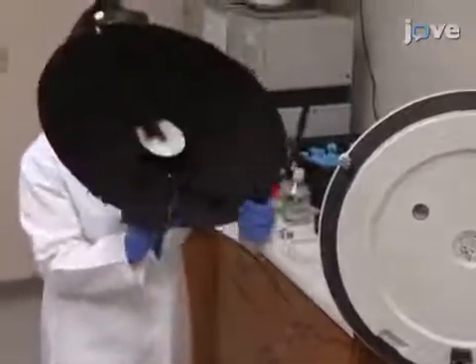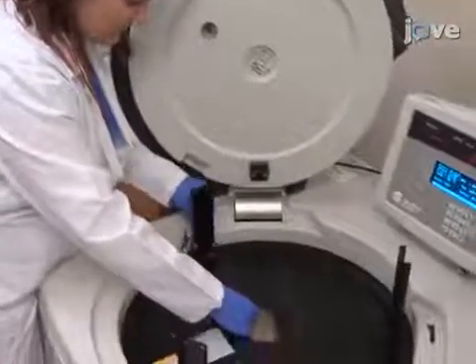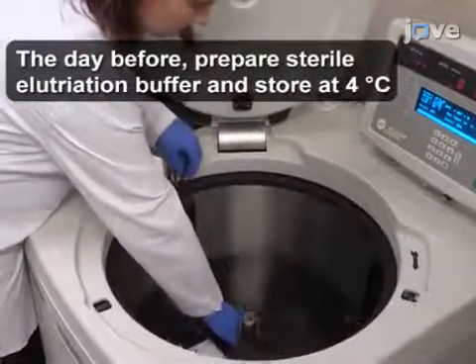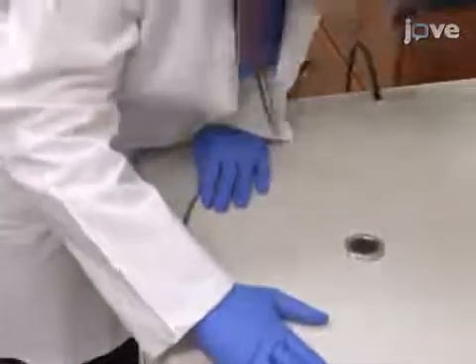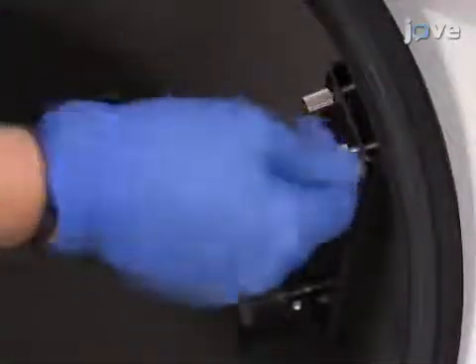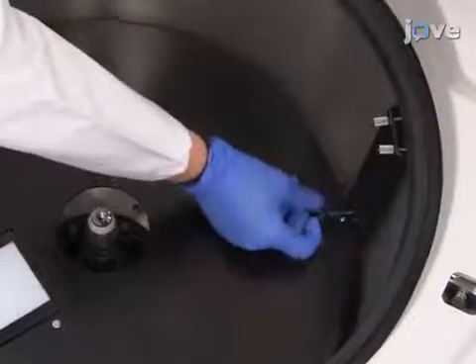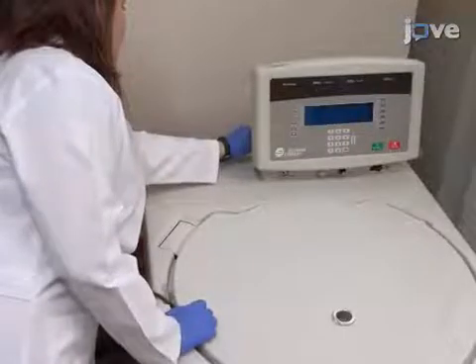To start the experiment, install the strobe assembly into the centrifuge such that the power cord is fed out of the chamber through the port on the left. Adjust the strobe flashlamp so that it lines up with the viewing window when the centrifuge is closed. Secure the assembly in place by tightening two Phillips head screws at the top of each bracket and then tightening the thumb screws at the bottom of the bracket. Plug the power cord into the strobe power port located at the back of the centrifuge.